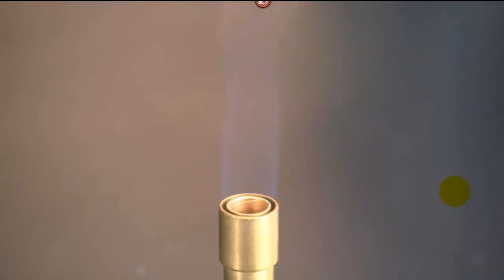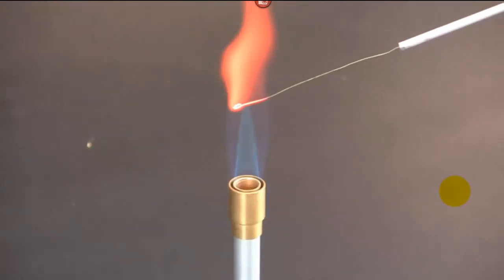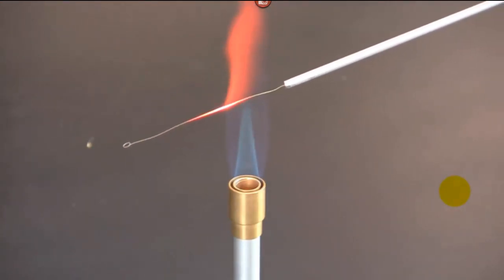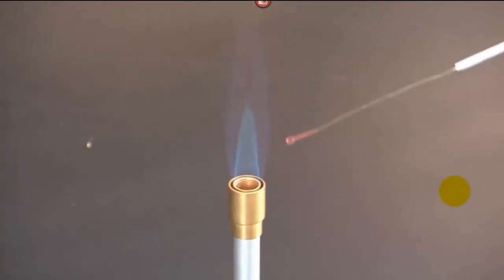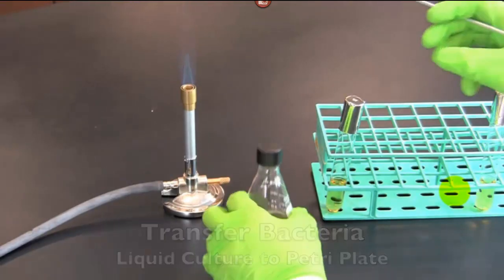And I'm sort of watching this video with you for the first time, doing the John Madden commentary, and I would think the next move he is going to make is to sterilize an inoculating loop. There he goes. And he started with the loop end. We have always done it where you start with the end closest to the handle and then you work your way out to the loop.